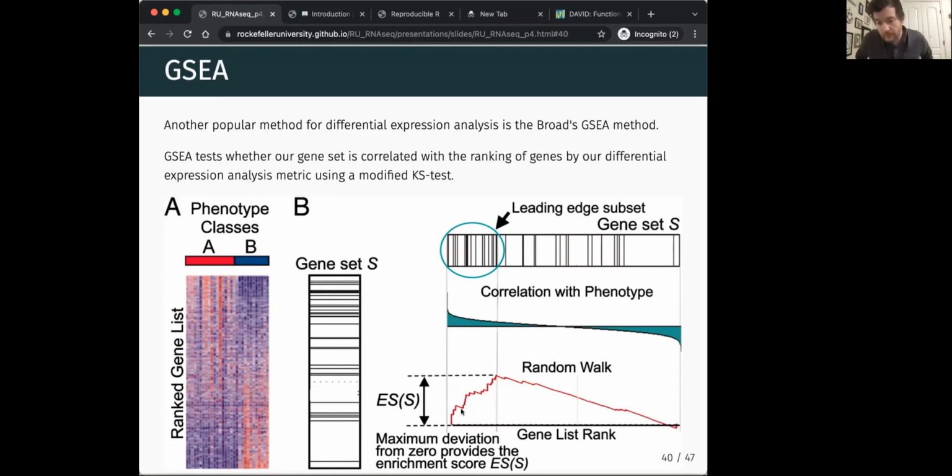Okay, and so we have the quick question. I think you kind of got it. Is it ranked by fold change? It can be. And if you're going to do fold change, we very much recommend it's the shrunk LFC value. However, we quite often use what was used in the original paper, which is the test statistic. So in the DESeq2 results, this is the stat column.